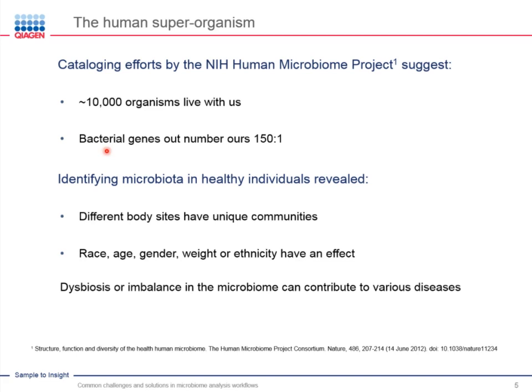So why is it coming up now, and why is it not something which has been obvious for years? Before molecular biology technologies were applicable for microbial analysis, you could only use things like culture assays to find bacteria. On the one side, this allows you only to detect and identify bacteria which you can grow. And on the other side, you will just find what you're looking for. For example, selective media for some bacterial strains are not suitable for growing other strains. So this was a very narrow view.